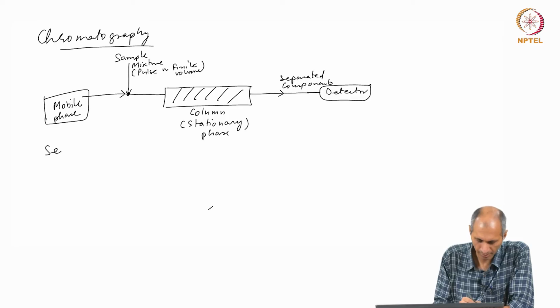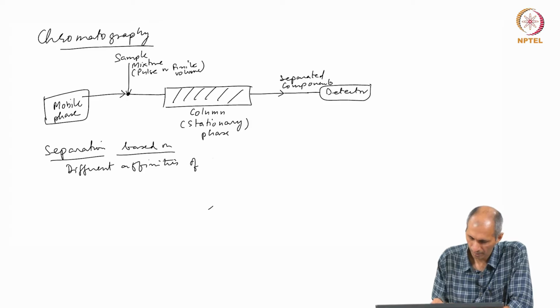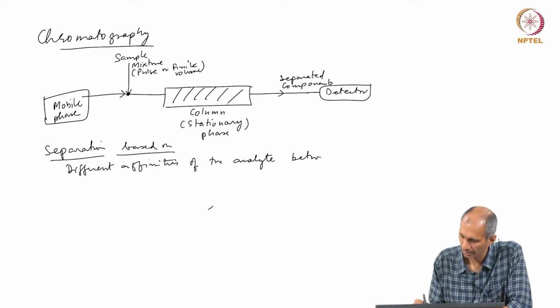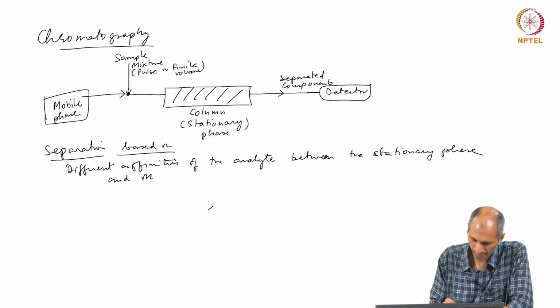The separation occurs mainly because it takes advantage of different affinities of the analyte between the stationary phase and mobile phase.